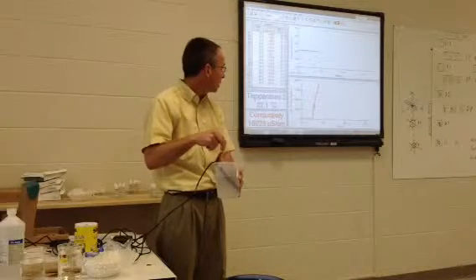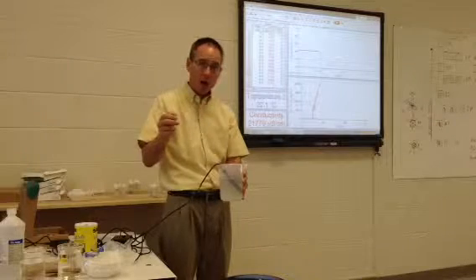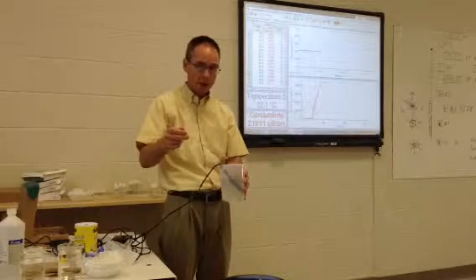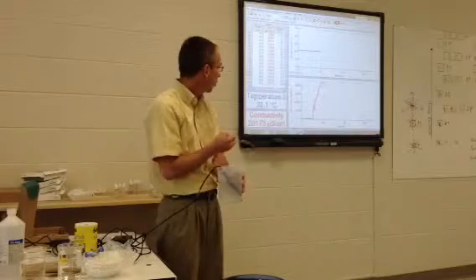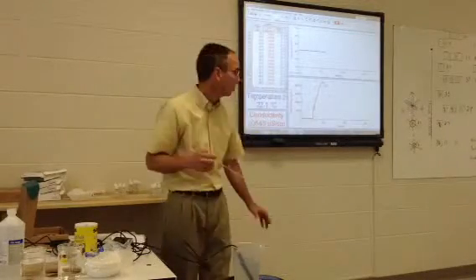Now see how that conductivity increased? All I did was add salt to water, but I formed ions. I formed sodium ion, cation, and chlorine anion, and they're much more efficient at passing electrical current through the solution than just pure water is. That's why you see that conductivity graph spike so much right here.